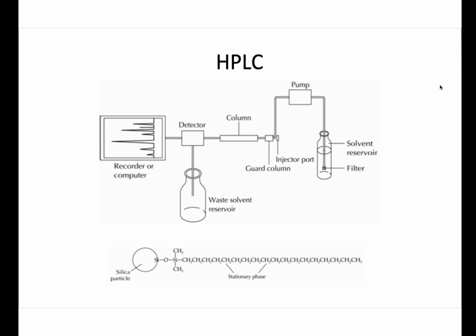On a very economic scale, it gives you a better idea of the separation. Can we use HPLC for the real separation of 2 grams of product? No, because the column is too small, and the vial we are using is 1 cc, 1 milliliter. So it gives us the idea of the components, and then we use mass spectroscopy to identify the components, which is not our discussion for today.